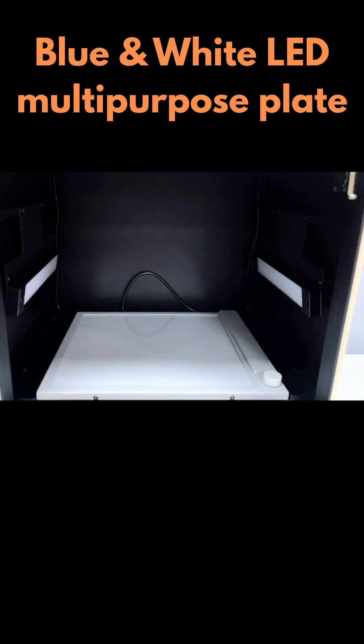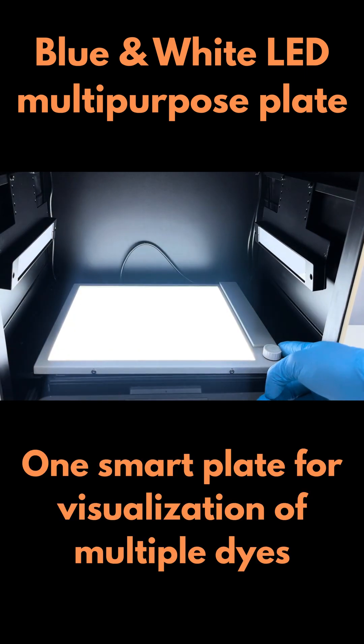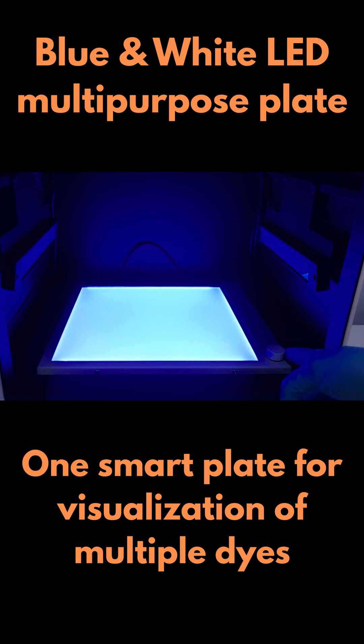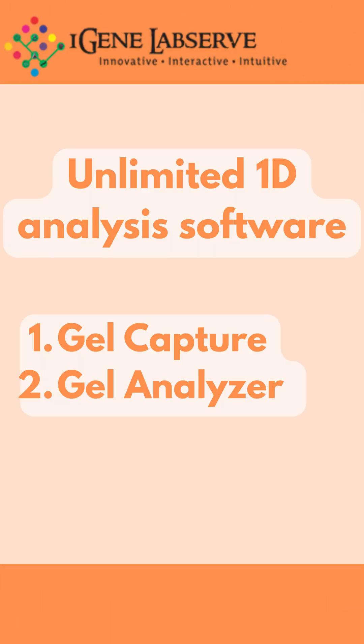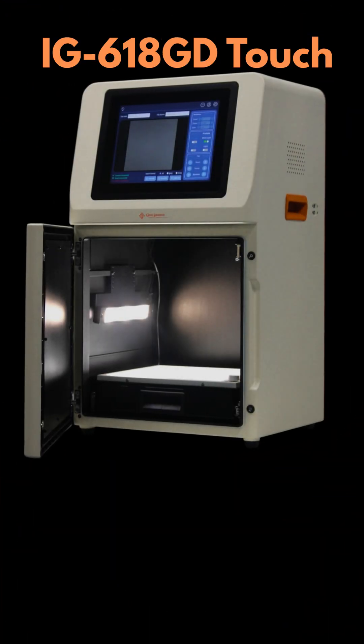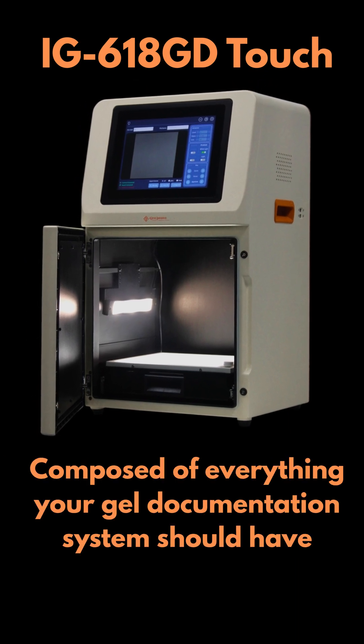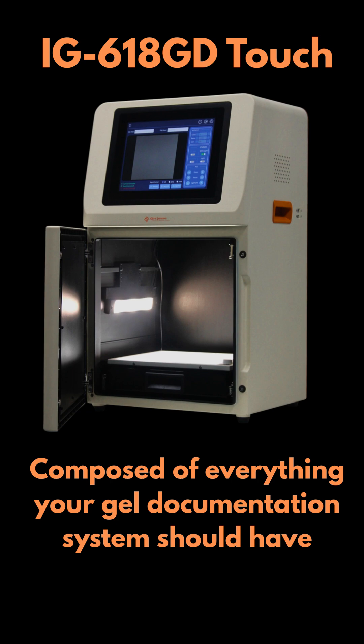Blue and white LED multipurpose plate to visualize a variety of stains on one smart plate, and unlimited 1D analysis software. Smart labs demand smarter systems. This is the IG618GD Touch — composed of everything your gel documentation system should have.